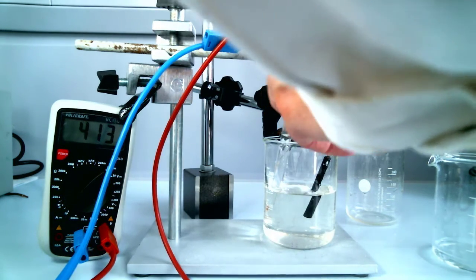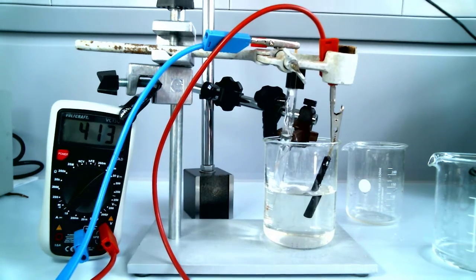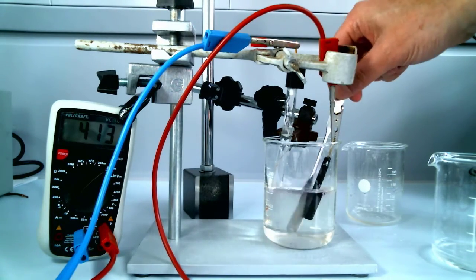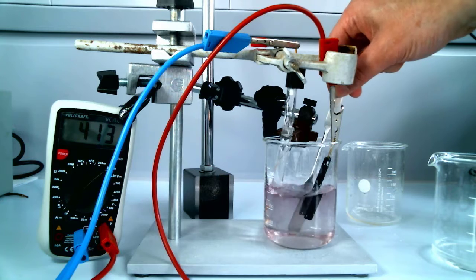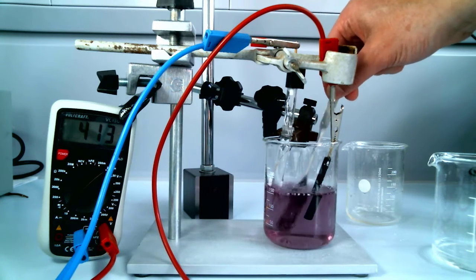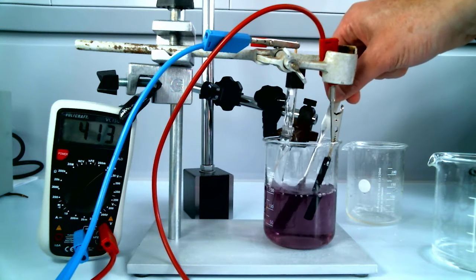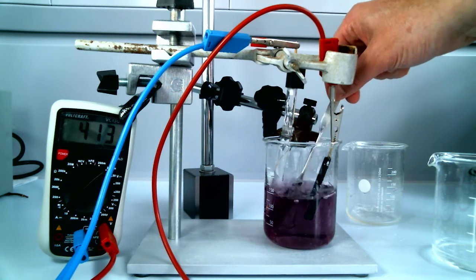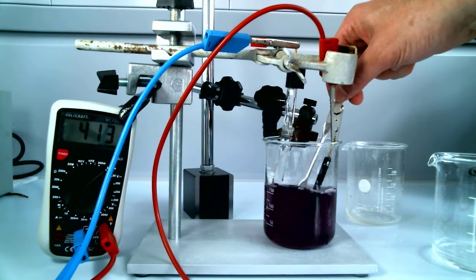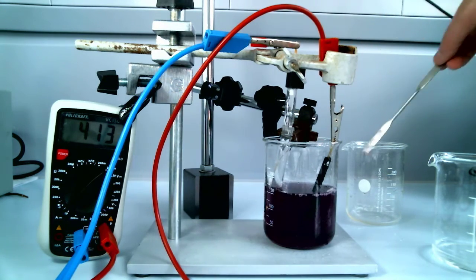It will make a colored complex of iron salicylate, which is one of the two oxidation states, is very, very soluble. It doesn't seem to have a very large effect on the voltage here. Not entirely sure why that is. It can have a large effect on the voltage. It doesn't have a large effect on the voltage using this carbon electrode.